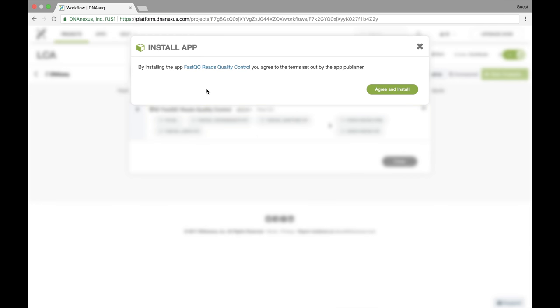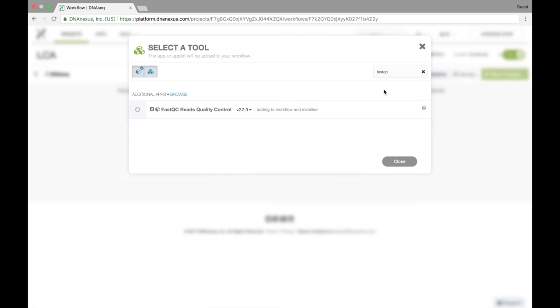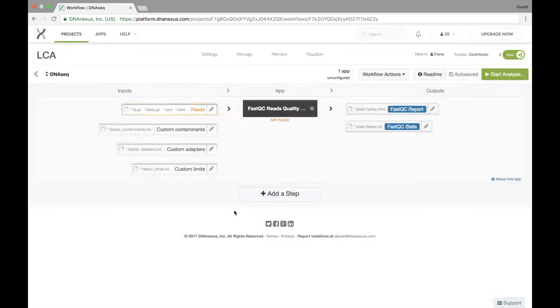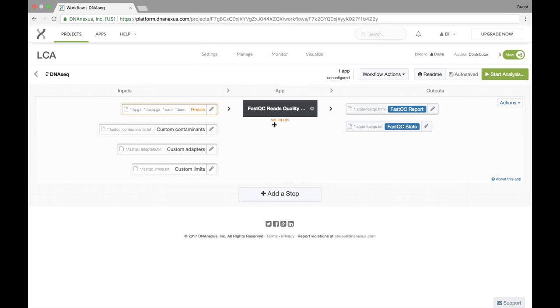Now as in our previous video the first time you select an app you'll be prompted to accept the terms set by the app publisher. In this case I'm not going to review the terms, I'm just going to agree and install. And I'm going to exit this view really quickly just to show you that FastQC has been added as a first step in our workflow.